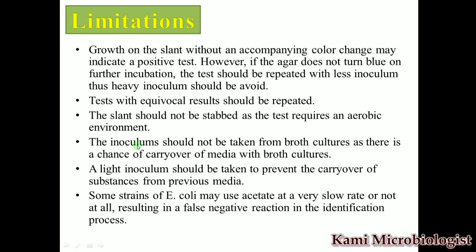Next point says that you have to take the fresh culture from the agar plate, not from the broth. The next point says that a light inoculum should be taken. Why? Because it will prevent a false result, or prevent the carryover of substances from the previous media. That's why you have to use light inoculum.